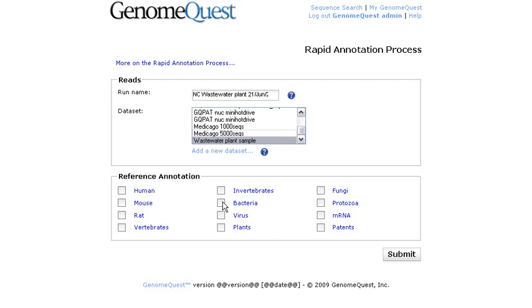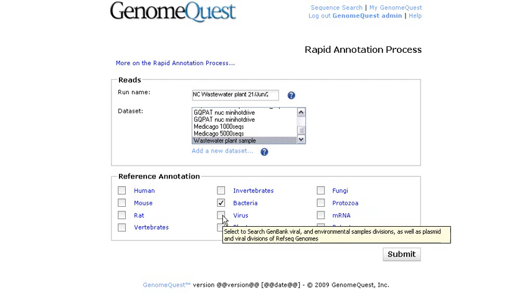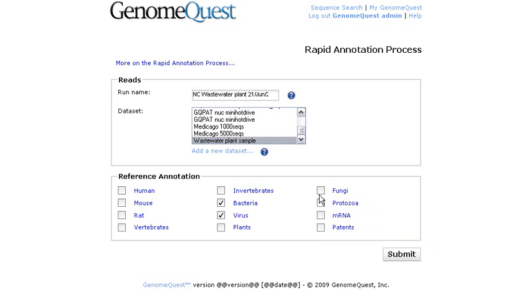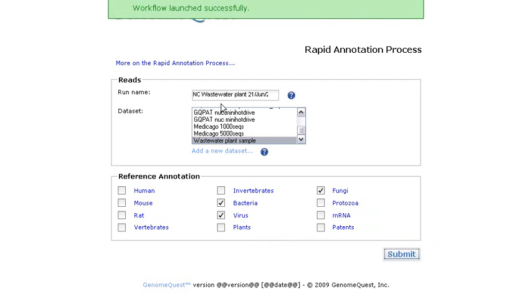And I want to annotate this set by bacteria, virus, and I could select others here. It could be fungi, etc. So here, I just need to submit and that's pretty much it.